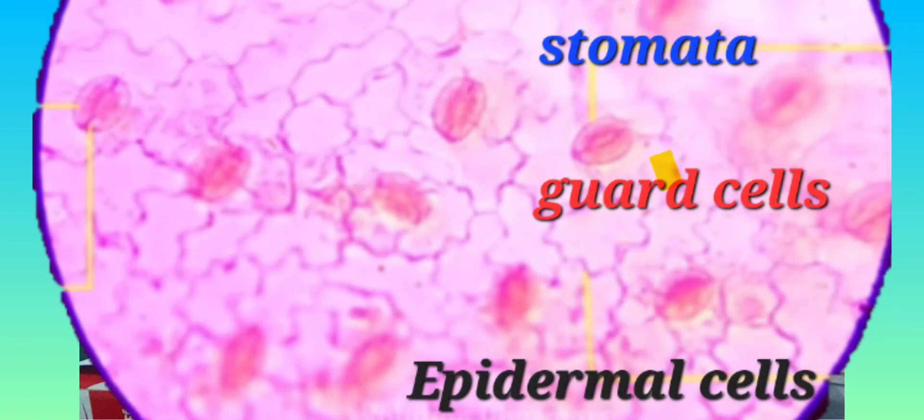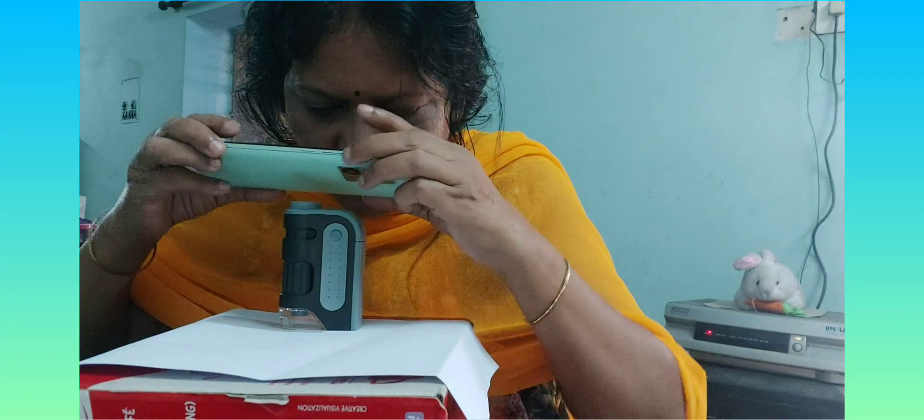This is looking marvelous — you will be excited to see this. I change the magnification to show you once again how it looks under high magnification. The stomata are openings on the surface of leaves — basically more on the lower surface of leaves or on other green parts of a plant as well. But when it comes to hard woody structures, it doesn't have stomata; it has lenticels.